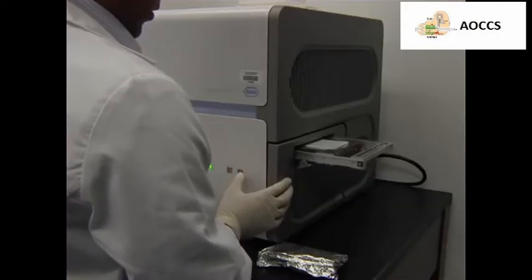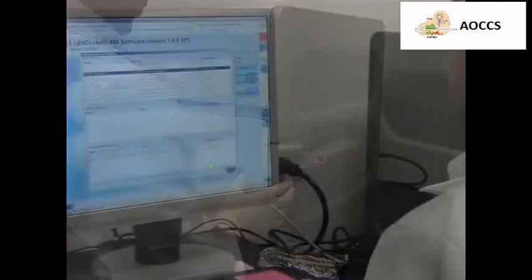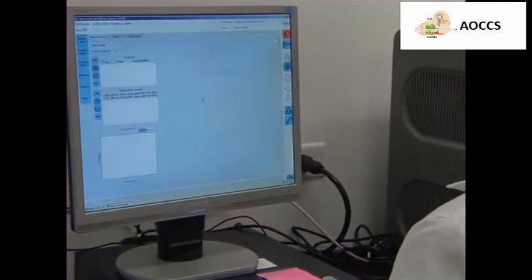Next, perform real-time PCR amplification and melting curve analysis following the parameters detailed in Table 2.